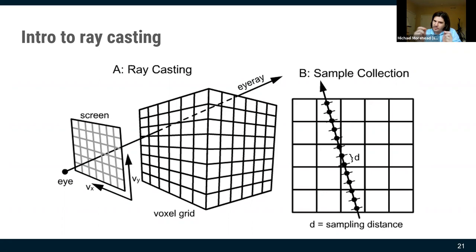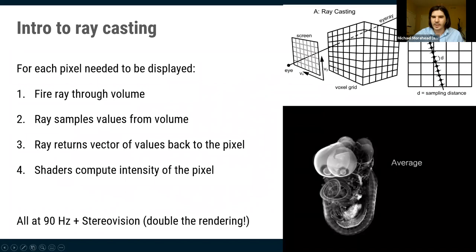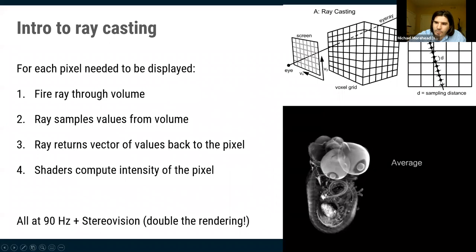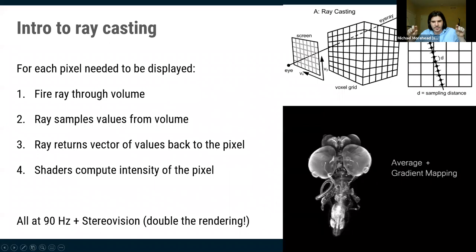Here's the recipe for direct volume rendering. For every pixel on the VR screen, you fire a ray. That ray travels through your 3D volume — a 3D matrix of intensity values — picking up values as it moves through. It creates a vector of numbers representing the intensities it passed through.